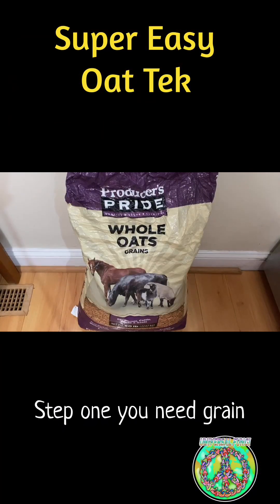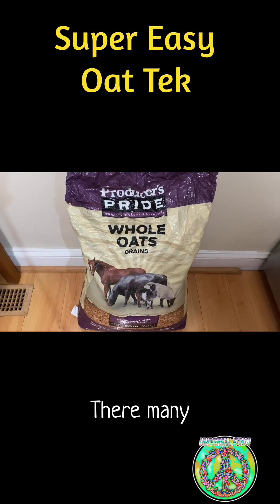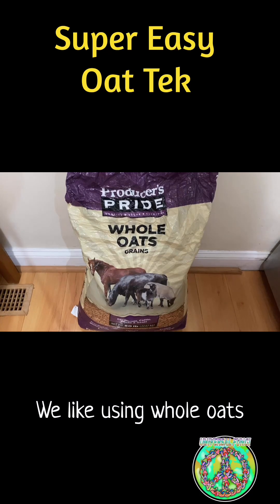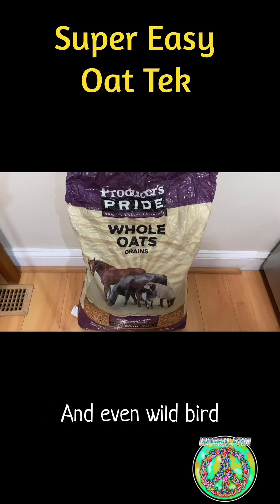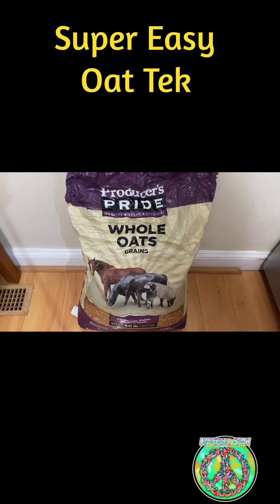Let's get started. Step one, you need grain. There are many grains to choose from. We like using whole oats, but rye berries, brown rice, millet, popcorn, and even wild bird seed, to just name a few, can be used as mushroom grain spawn.